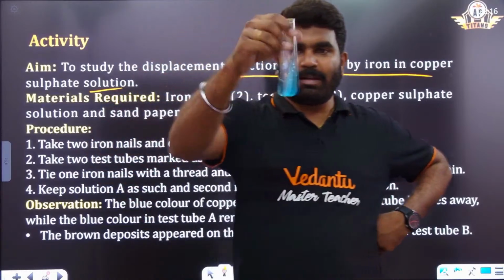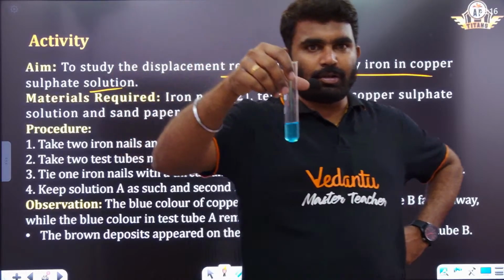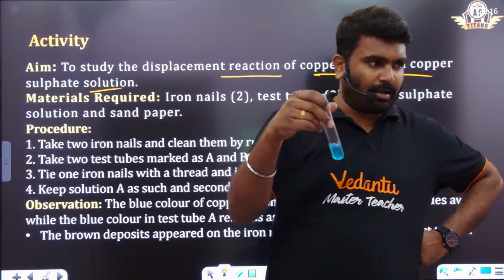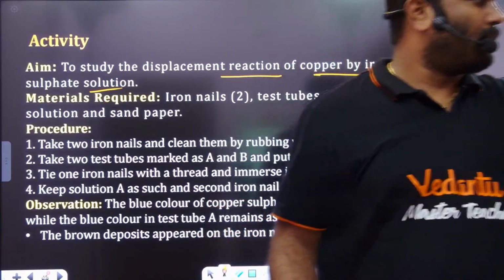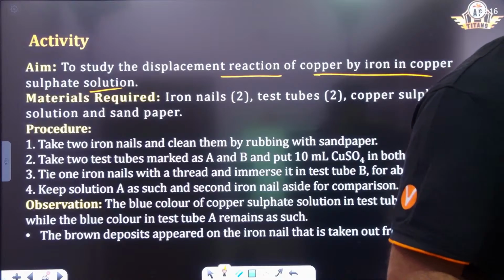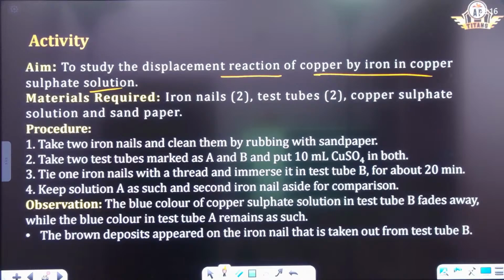The solution becomes what, beta? The solution becomes blue in color, right? Okay. So what I am doing, with the help of the iron nail I have with me, just a minute, I'll check my iron nail. Give me a minute.